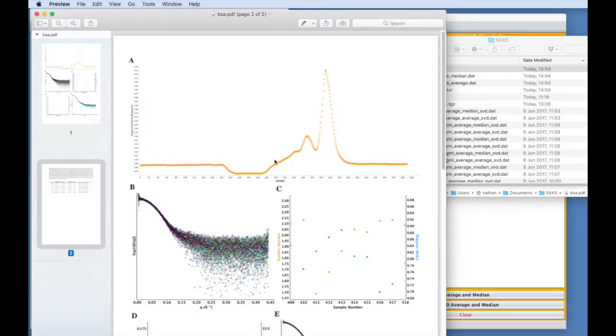We've got the full trace, we've got a whole lot of overlapping images from that window that I selected. This Durbin-Watson and Shapiro-Wilk test relate to a statistical analysis of how the scattering signal is varying within the window that I selected. So you can imagine if there's a real direction to this, you start off with the first image and then the second image is very different, and then the next one different again. You would see a direction to these statistics.